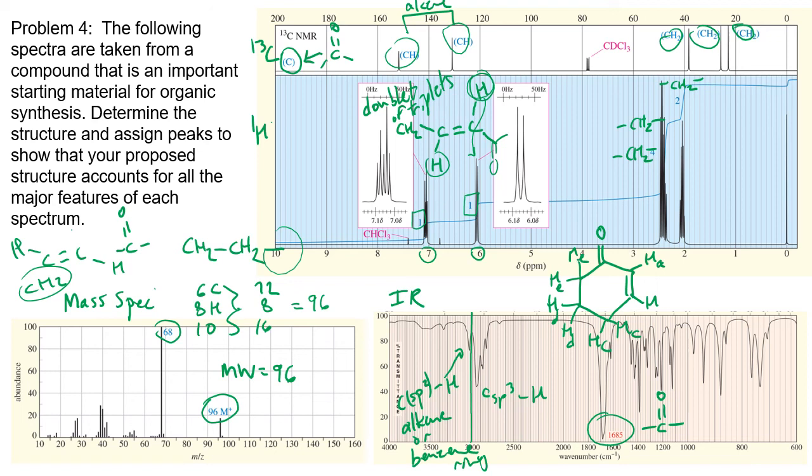Okay, and so HA we know is kind of isolated by itself. This must be HA as we've labeled it. The peak above 7 must be HB. And that makes sense because if we think about those resonance structures again, we have partial positive charge on this carbon, but we also, if we drew a resonance structure, have a partial positive charge on that carbon.